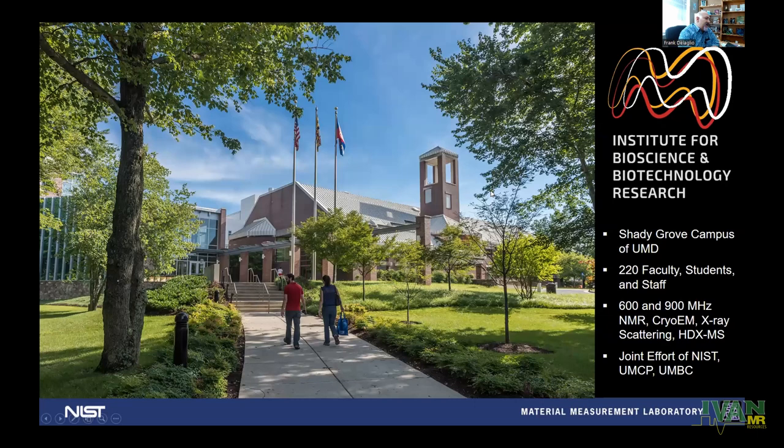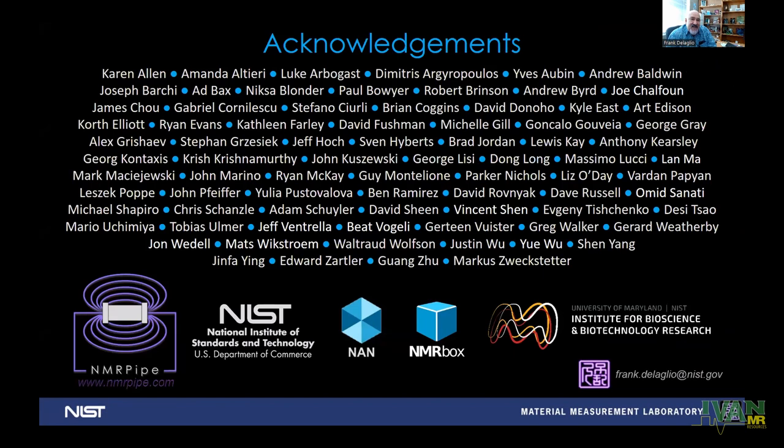So the software that we're going to present today, NMRPipe, has been in development for more than 20 years, and lots of folks have made excellent contributions to the software. I'm grateful to all of them. And several of these folks are actually on the call today. Now, NMRPipe, first and foremost, is built and continued as a tool to support the computational work in the laboratories where I work. But we do what we can to make these tools available to everybody in the community.